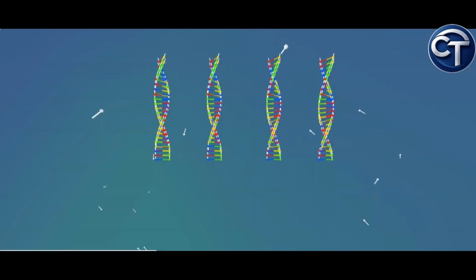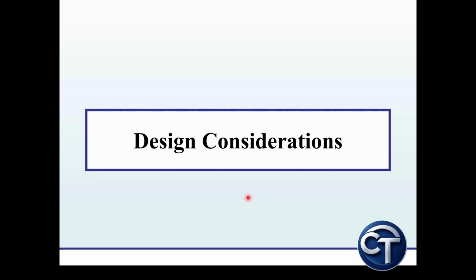Firstly, let's talk about what in silico primer designing is. The term in silico refers to computational processes carried out using software and algorithms. In silico primer designing involves inputting a DNA sequence into a computational tool, applying defined parameters such as length, melting temperature, and GC content, and the third step is generating optimized primer pairs. This method allows us to simulate experimental conditions before performing actual lab work. It significantly reduces trial and error and improves reliability.